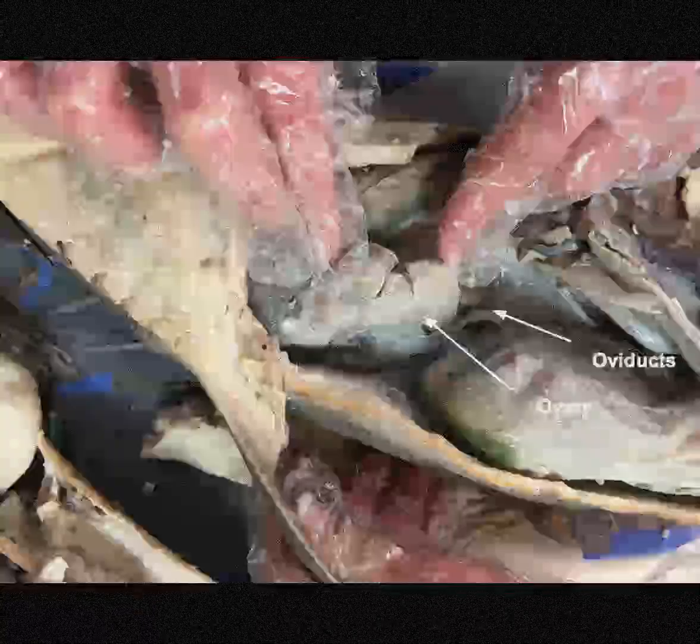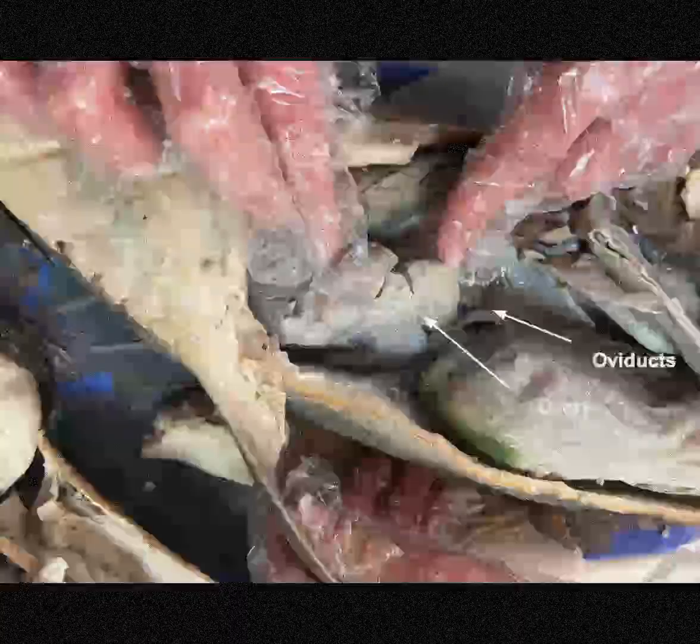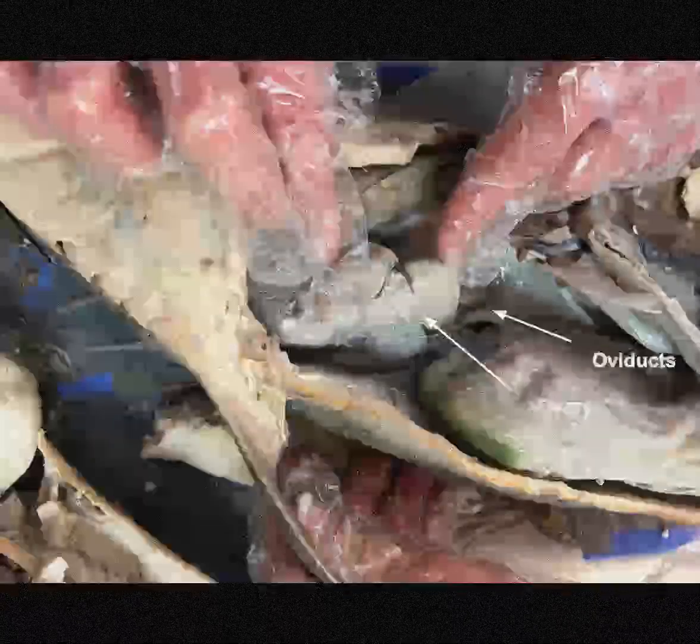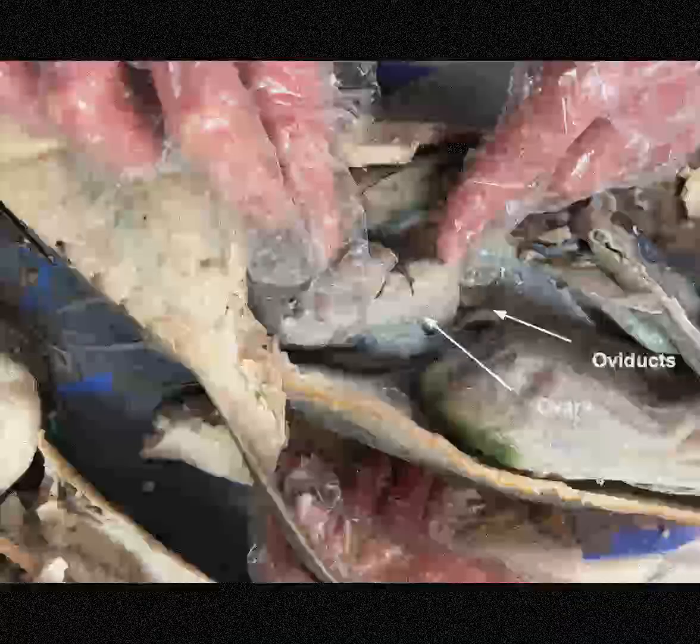Our shark is a pregnant female, so we have 2 cream-colored ovaries dorsal to the liver. They function in the storage of eggs. The oviducts are elongated tube-like structures lying alongside the kidneys. That eventually forms into an enlarged uterus, which we found developed in unborn shark pups.